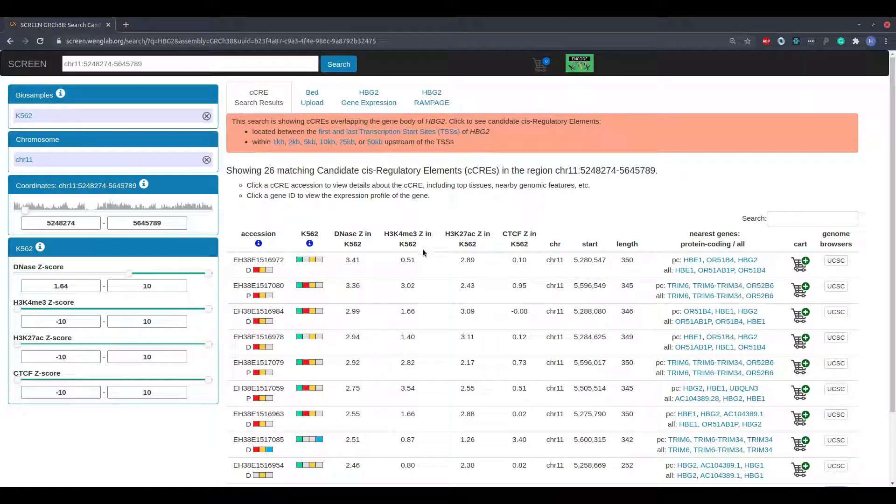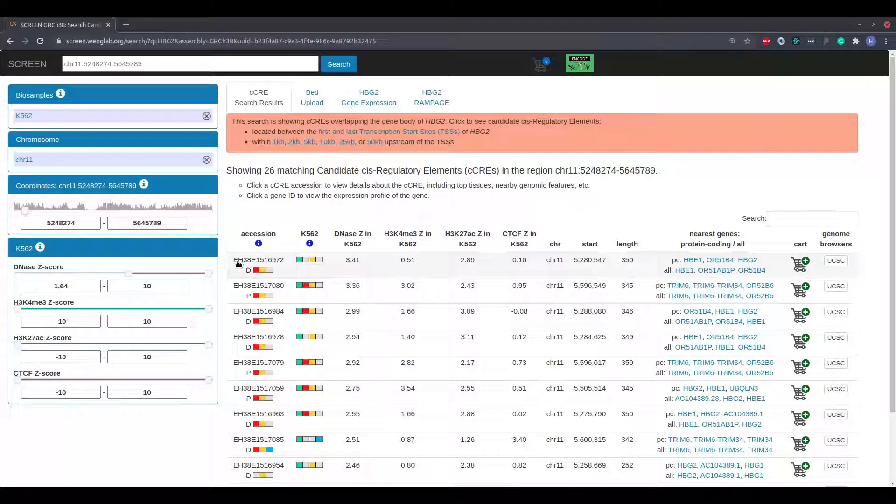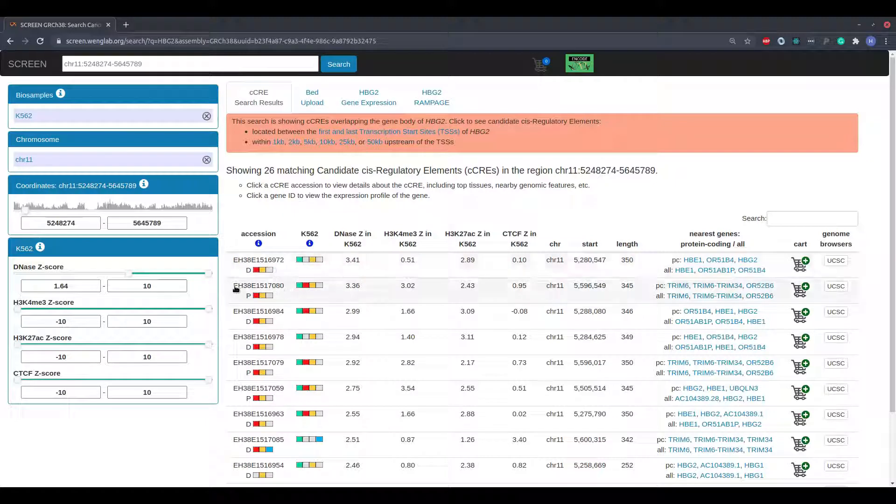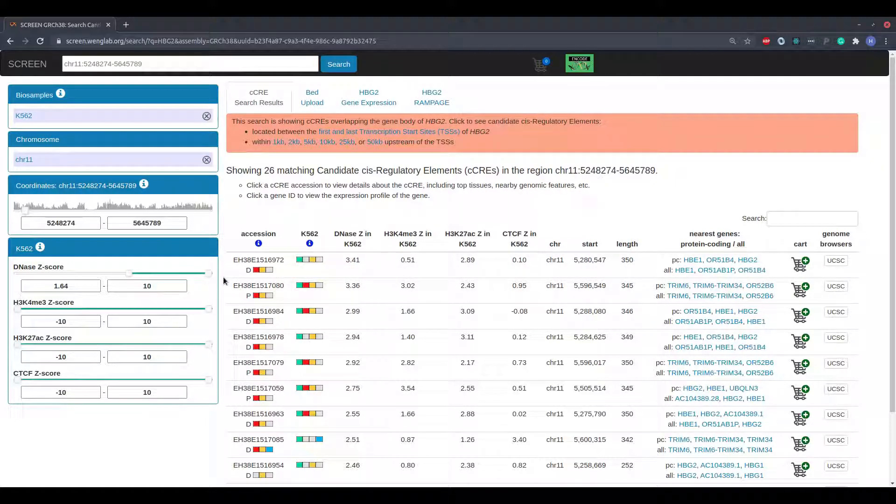Each candidate regulatory element has a unique accession, which is displayed in the leftmost column of the table. The left two columns also contain symbols which provide a summary of each candidate regulatory element's epigenomic profile in the selected cell type and across all cell types.